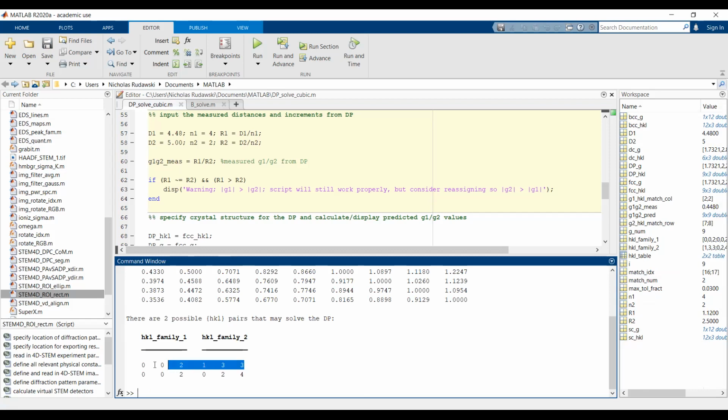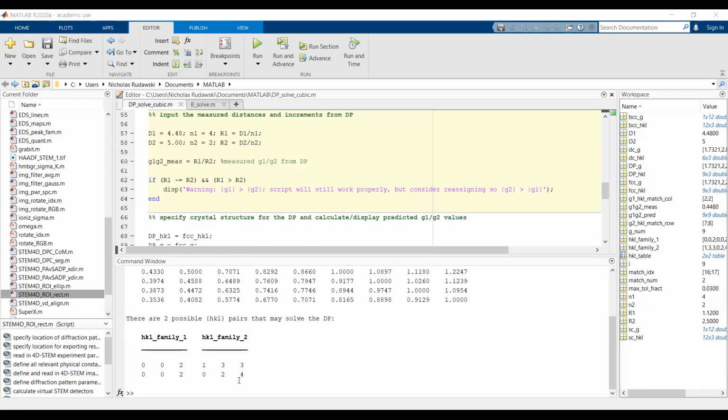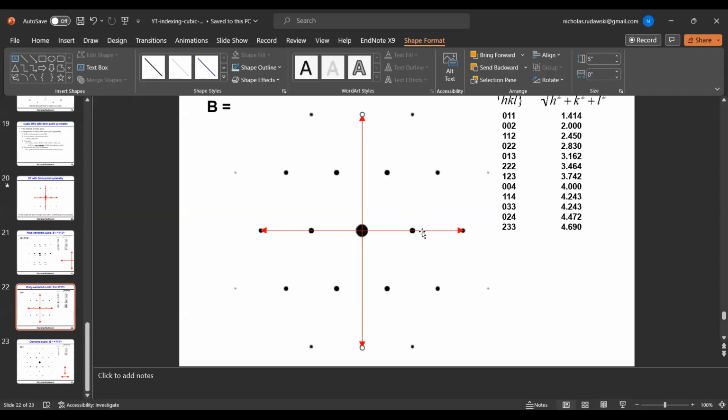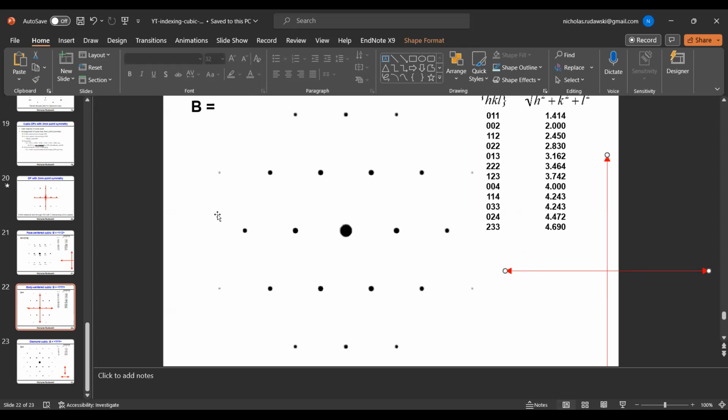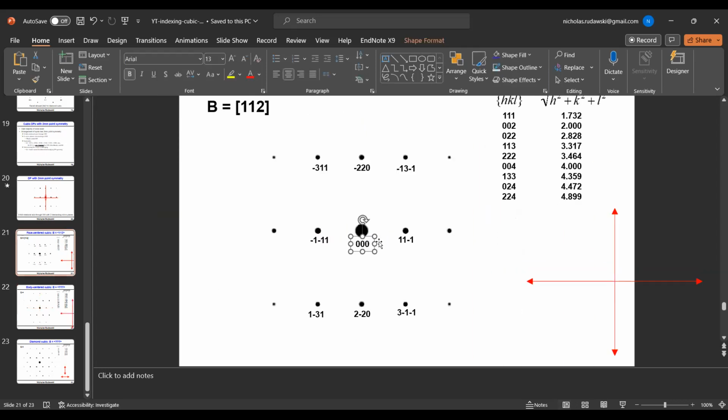First one we can rule out, mathematically it does not work. We cannot get a 0 dot product. This one we can though, very easily. We could just have 2, 0, 0 and 0, 2, 4 and we would be fine. So let's assign the indices as that. Let me move our arrows out of the way here.